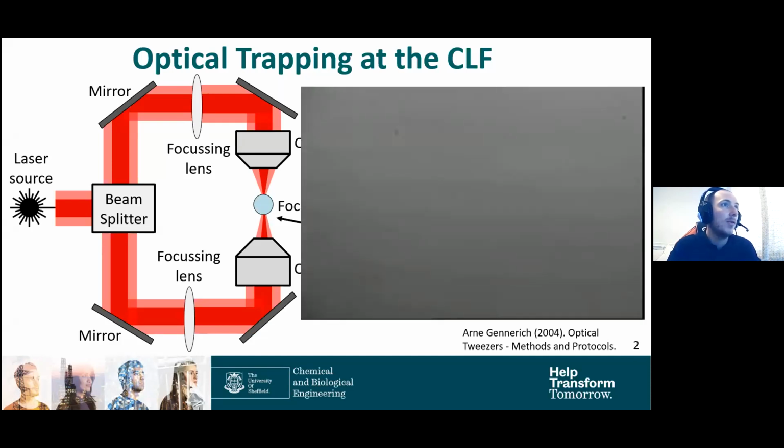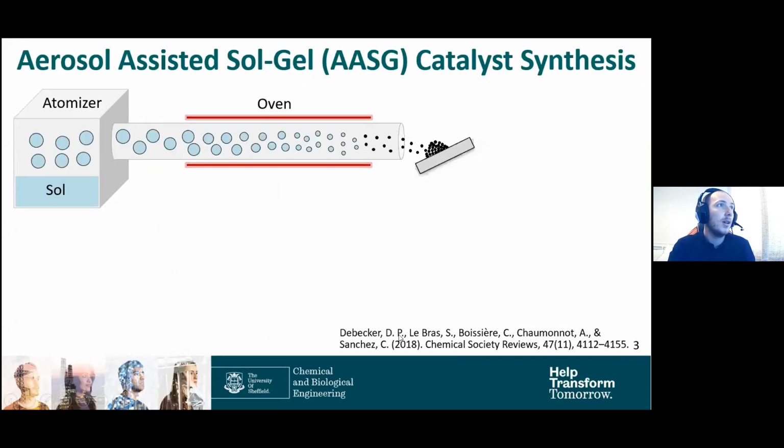And hopefully we've got a video for you. Now this is a 2-micron droplet that's getting trapped, and this is a mist of particles. The laser is being filtered out, but that is essentially what we were watching for a few weeks of different things being trapped.